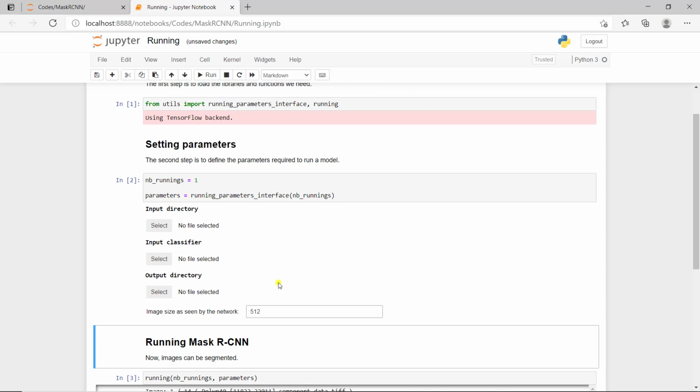So we actually have images with nuclei that look bigger, and so that's going to change the way we want to define the maximum dimension. So here maybe we can try different scales. So let's first define the different parameters, and maybe if we want to test, we can use only one image.